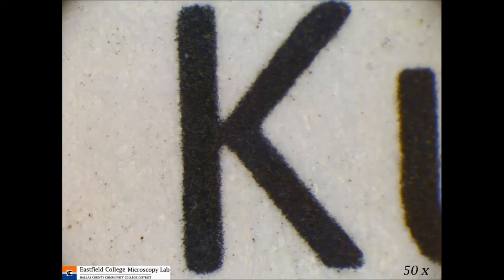I mounted the little piece of the email under my light microscope, and this is what it looks like at 50 times magnification. At this magnification you can already see that what we perceive as a solid letter is actually a little ragged looking. You can also see the fibers of the paper. So let's go up a little bit in magnification.